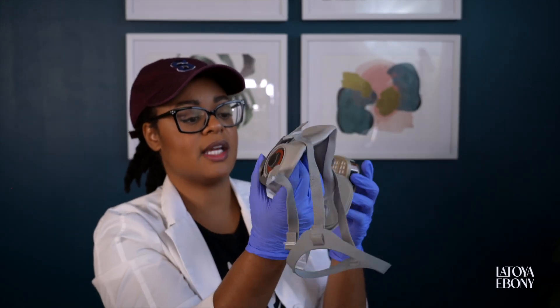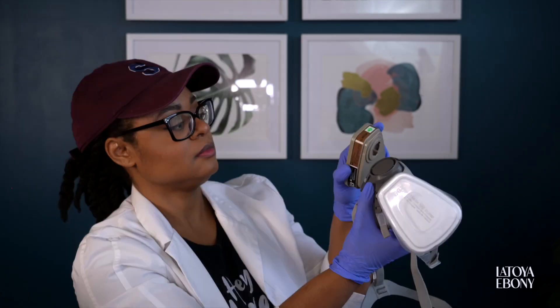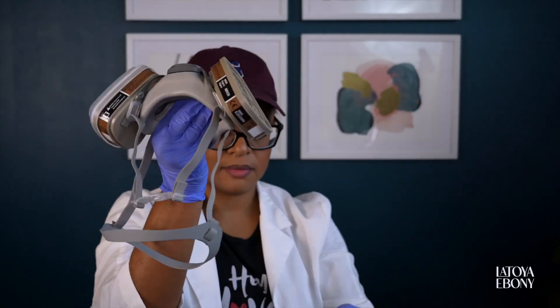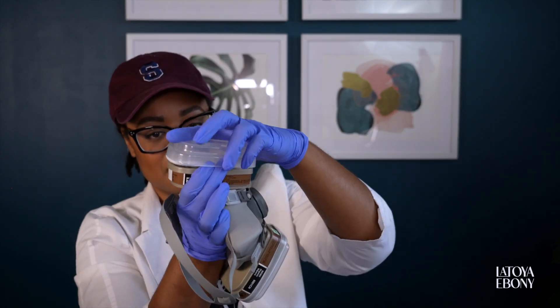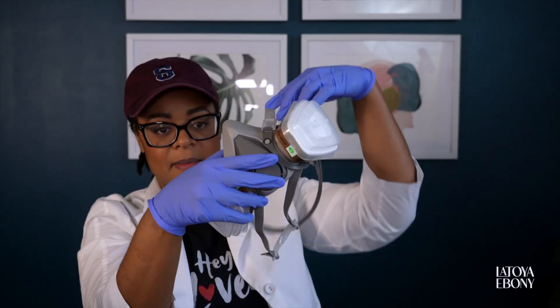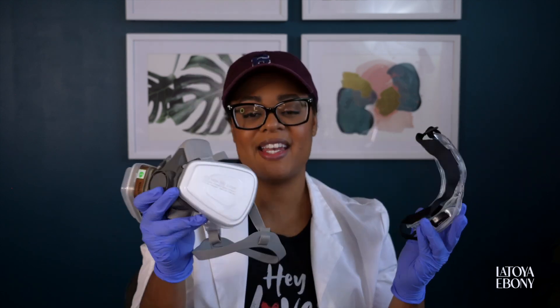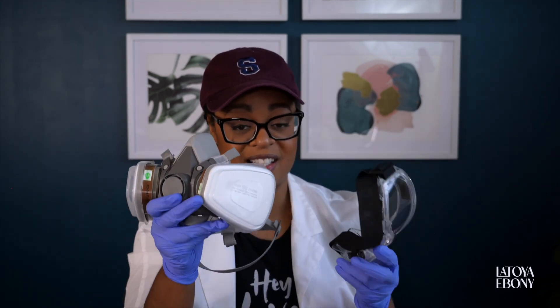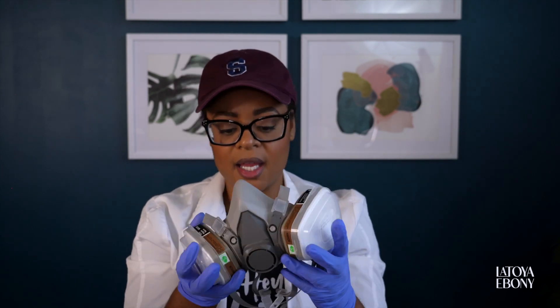I'm going to assemble it quickly so you can see. That part goes on like that, then you take one of these filter pads that it comes with, put it on, and cover it with this plastic piece. And voila — you're able to put your mask on like that, then put the goggles on over that. It is super heavy duty. I'm glad I assembled it so that when it's time to use it, I don't have to figure it out — super sturdy and really comfortable feeling.